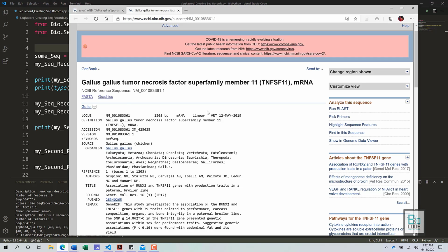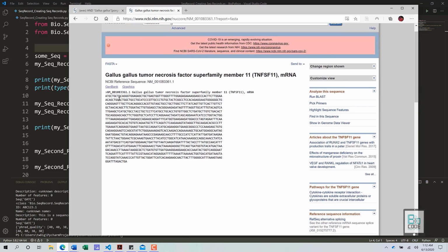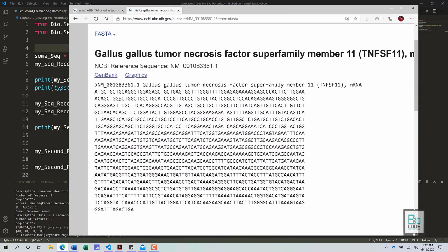So first of all, I'm going to demonstrate what actually a FASTA file is, if you do not understand it by now, but I'm going to explain it more. You need to watch our FASTA versus GenBank video and FASTA format and GenBank formats video to understand this particular video and the further videos that are down the road. Otherwise, it will not make sense to you.